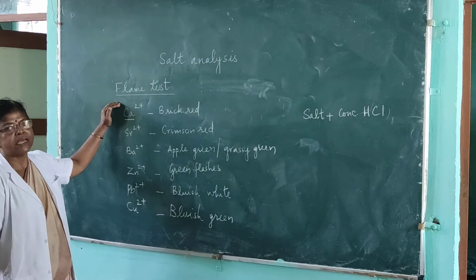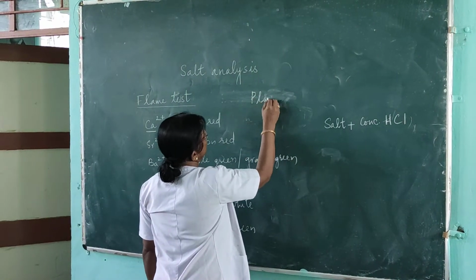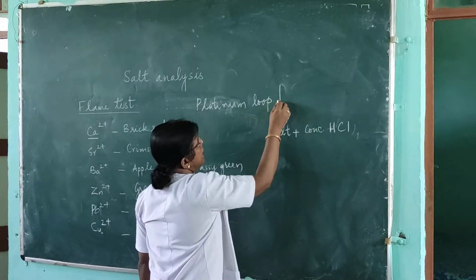This flame test is done using a platinum loop or a nichrome wire.